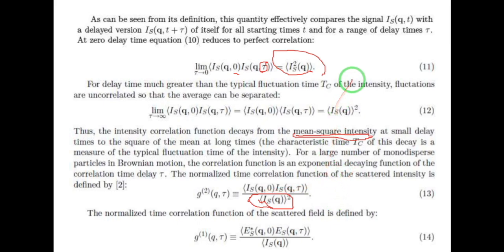So for the delay time of 0, I want you to remember that the final value is going to be 1. Okay, now let's see what will happen if we increase the delay time.